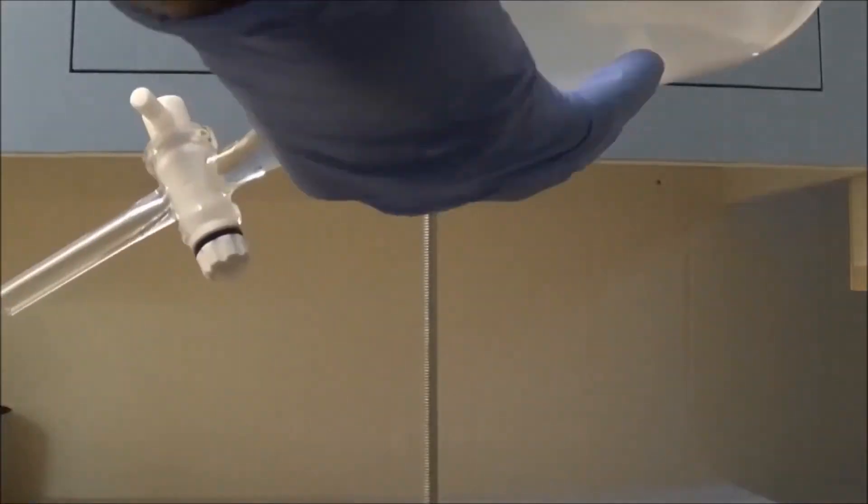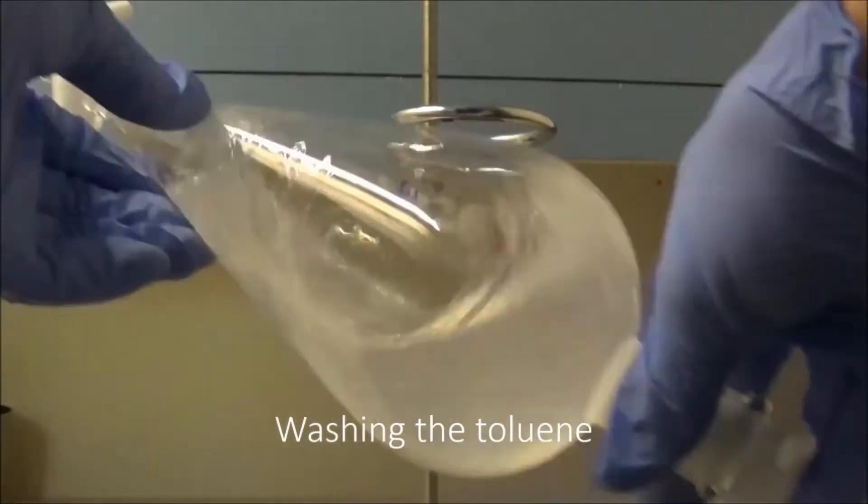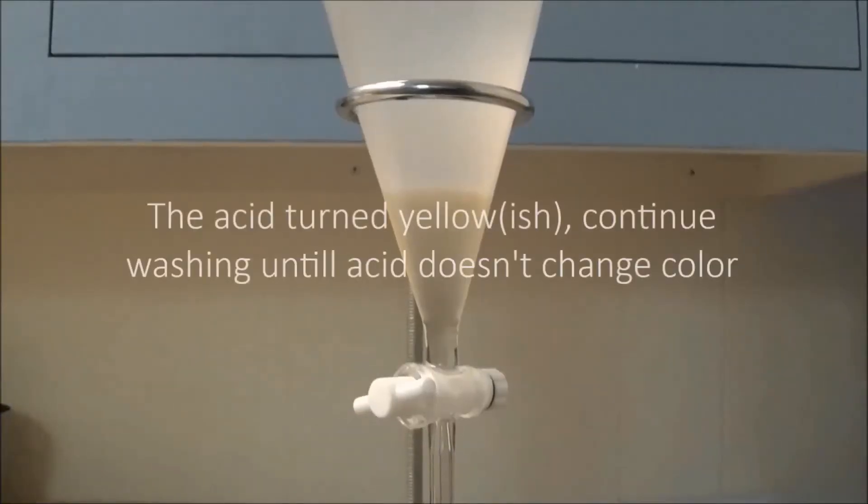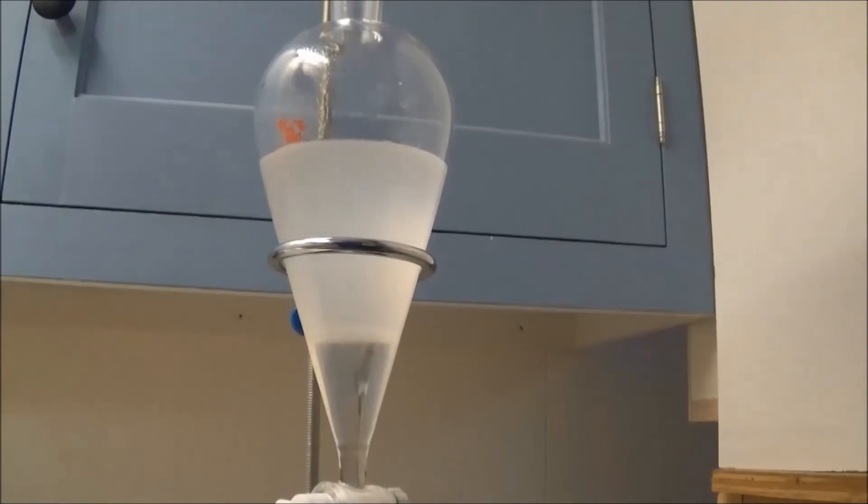The separatory funnel was then shaken well to wash the toluene. This washing was continued with fresh acid until the acid didn't turn yellow after shaking. This was another two times in my case.